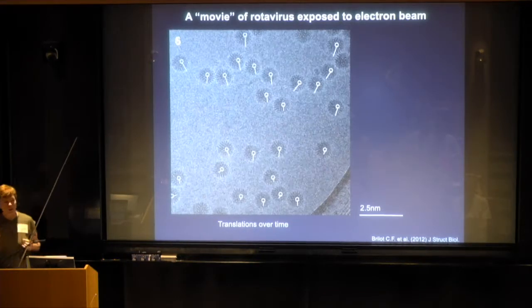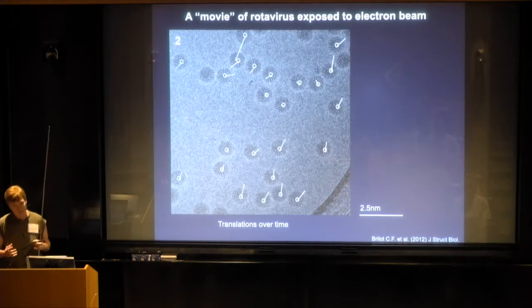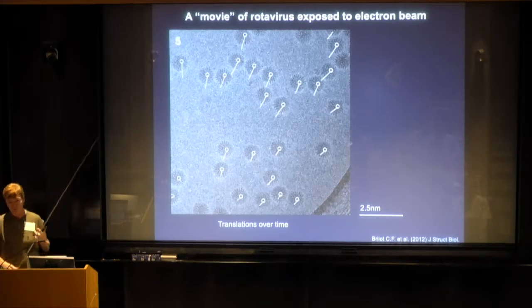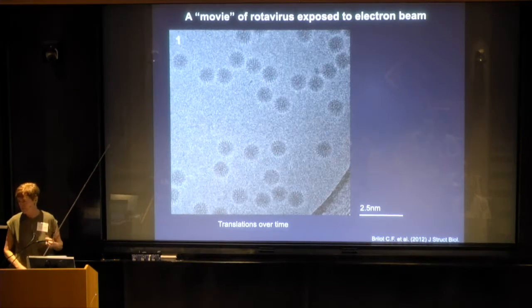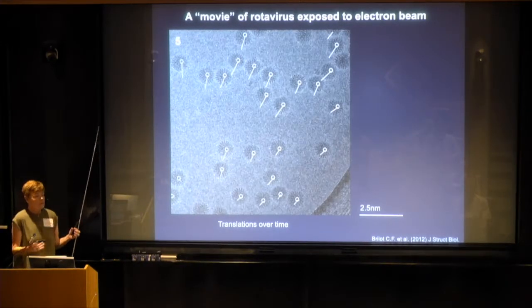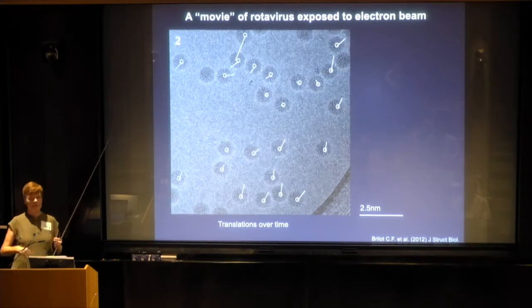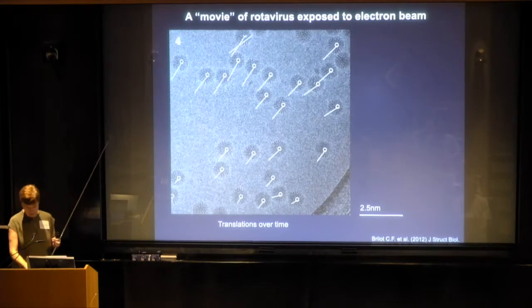So it is small wonder that until this revolution came along, we were not getting atomic resolution structures out of images like these. I mean, if you want a 3 angstrom structure, you better not have movement of 10 or 20 angstroms through a structure. And the only reason we were getting anything out of EM was because we were averaging our way out of it, averaging millions and millions of particles, getting the ones that were stationary and throwing the rest away.